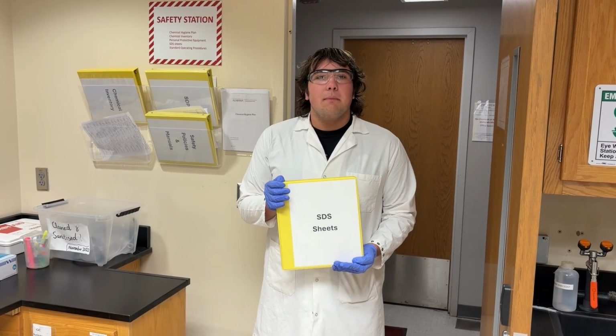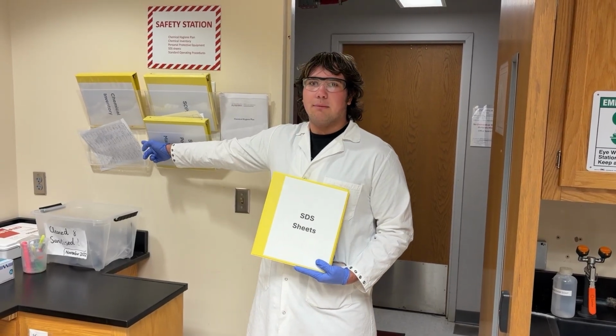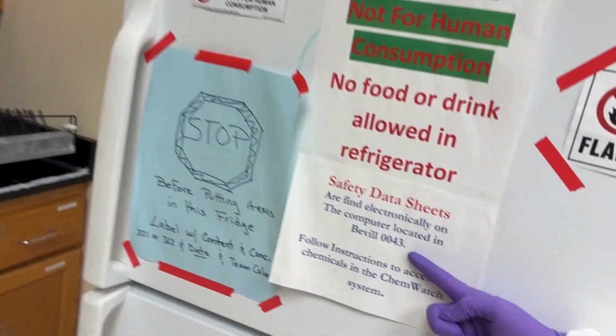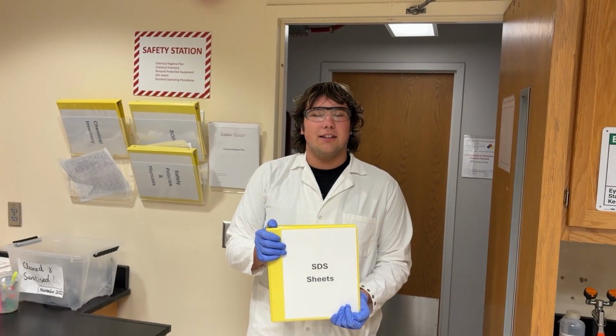Before you start the experiment, make sure to read the safety data sheet located in every lab, or electronically. And make sure you wear gloves.